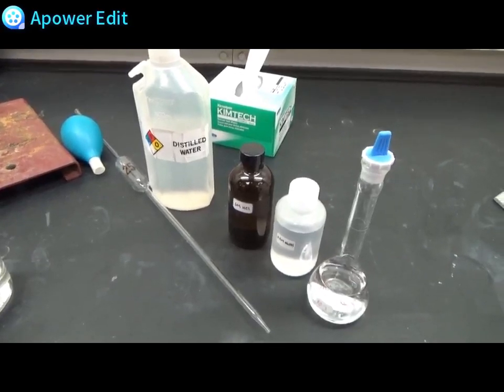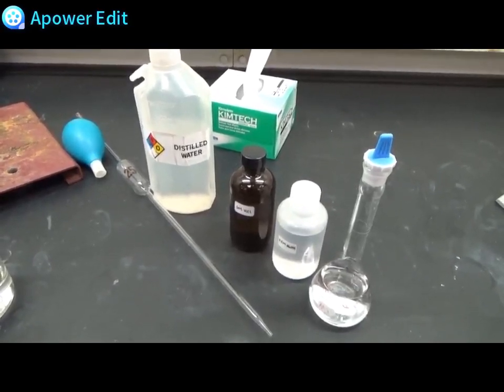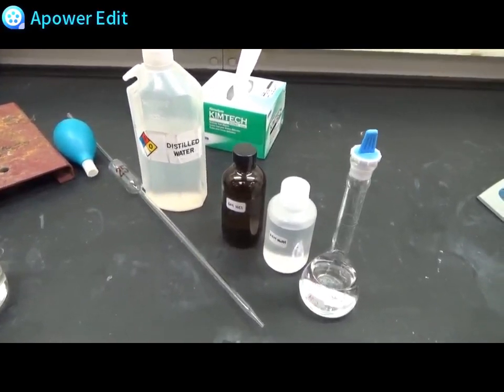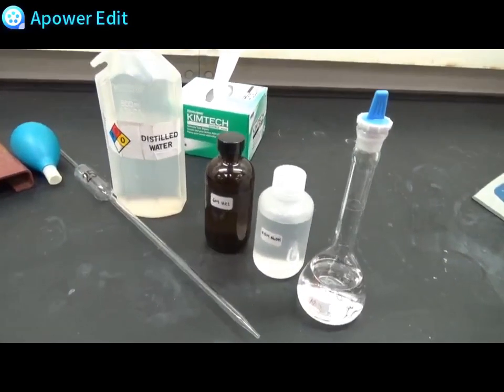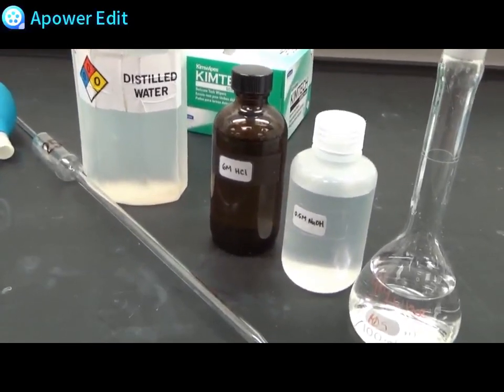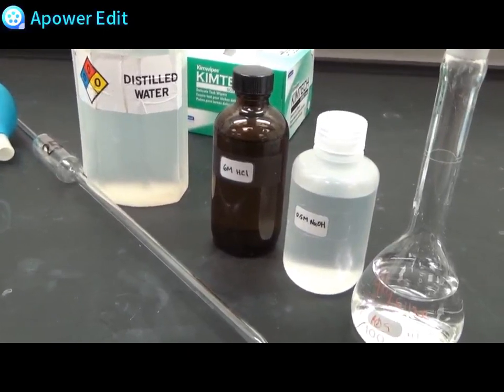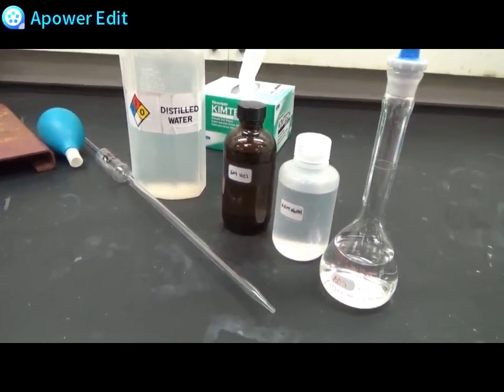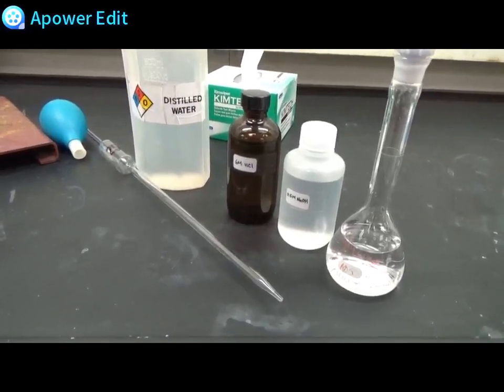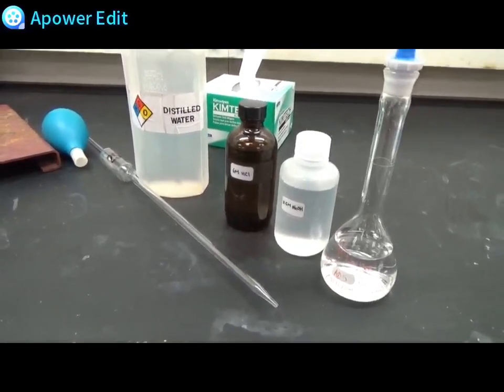The chemicals that you will need include a 0.5 molar glycine solution, 0.5 molar NaOH, 6 molar hydrochloric acid, and distilled water for rinsing your pH probe as well as to include in your acidic solution.